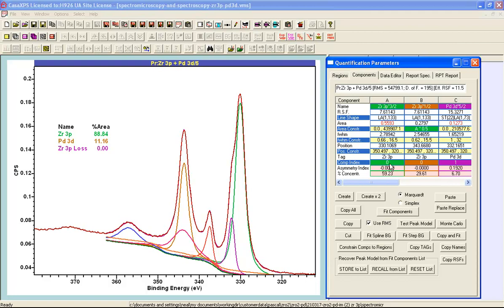An alternative way of choosing the colour is via the component index, and the component index picks out a very specific colour. Instead of simply relying on the order of the components here, it picks out for these two the same colour because they both are assigned the same component index.